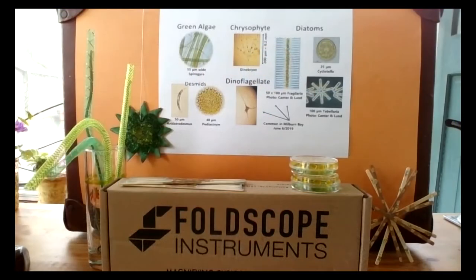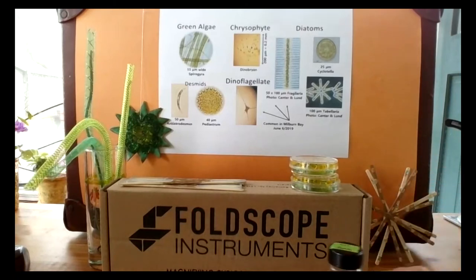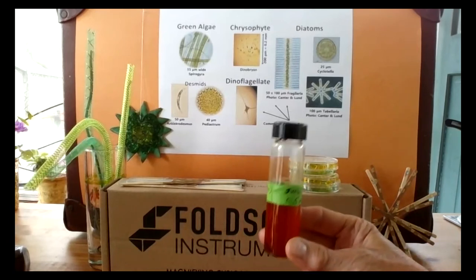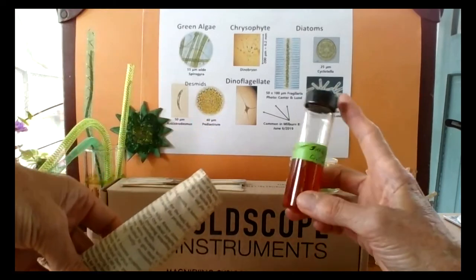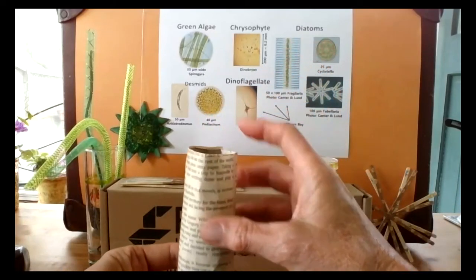On the day of collection, or if you just want to preserve your phytoplankton for a later date, you can put a few milliliters of water in a small jar and add rubbing alcohol plus several drops of iodine from your medicine cabinet. Voila, this is just like Lugol's solution from the lab. The iodine stains the starches in plant and animal cells. It does get damaged by sunlight, so you need to keep it in newspaper or a box.